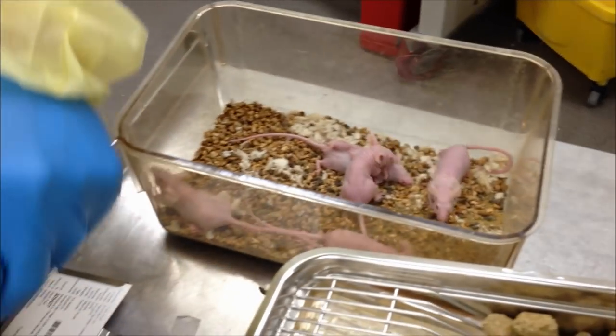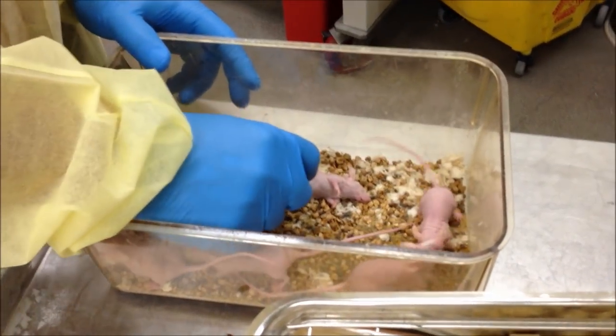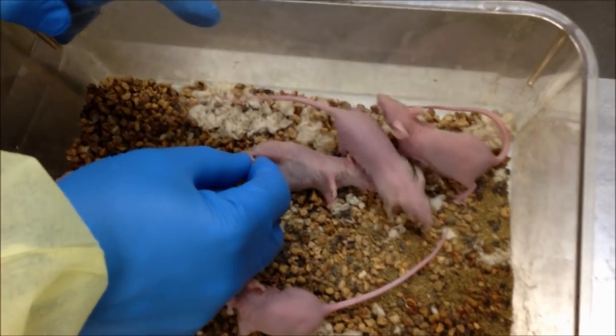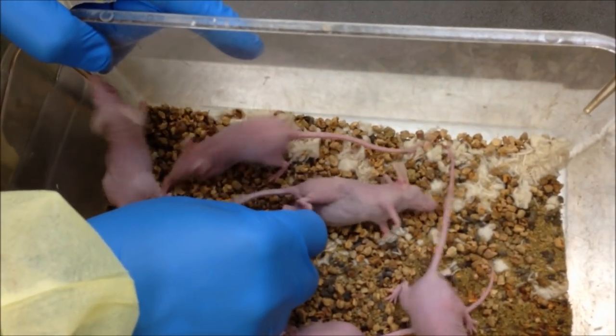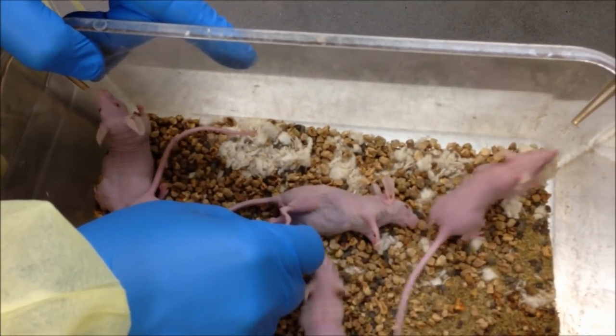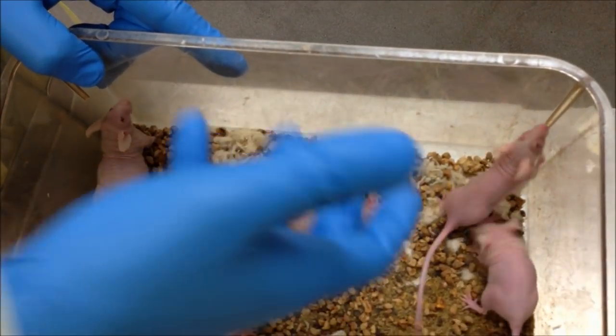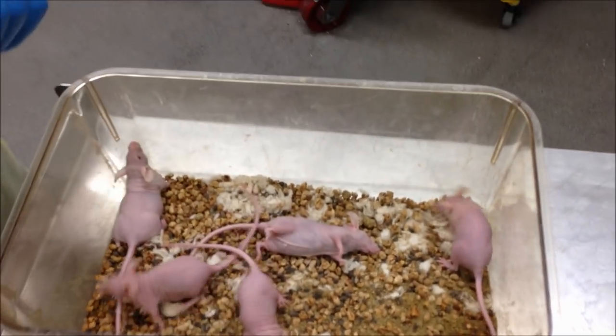To make sure the mouse is sedated, what you want to do is grab the toe and give it a little bit of a squeeze. If you squeeze it and it reacts, it's still not totally out. See that? It's giving me a little bit of reaction. But once you squeeze it and the mouse doesn't react to it, we're ready to use that animal. Okay?